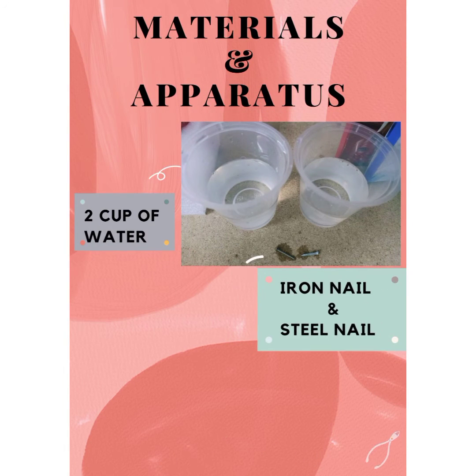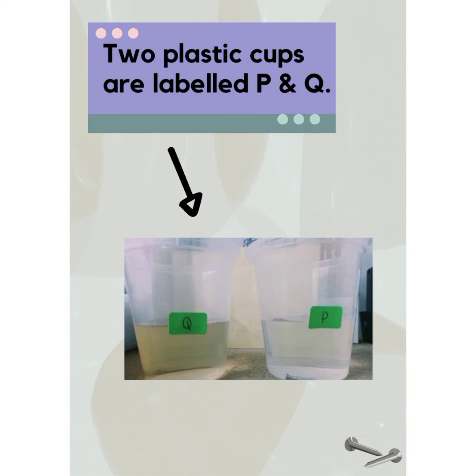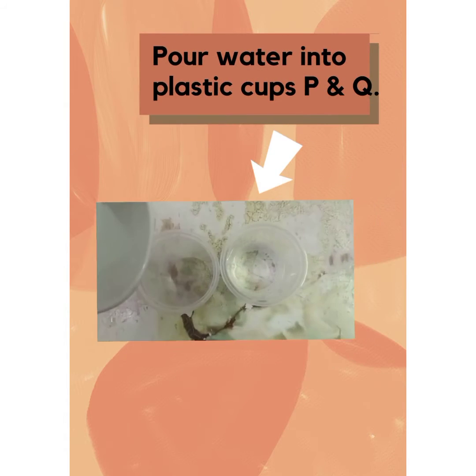The materials and apparatus include 2 cups of water, iron nails and steel nails. 2 plastic cups are labelled P and Q. Pour water into plastic cups P and Q. Put nails into the plastic cups.